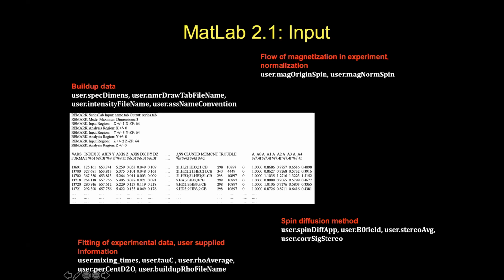You will have one parameter that is the assignment, ASS, and it looks like that. We put the assignments of all 2- or 3-dimensional NOESYs into here, and it has to follow this format here. So this means that the different dimensions are separated by this semicolon shown here.